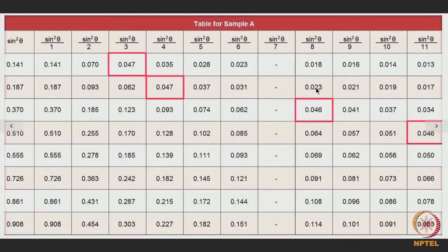And when we divide the sin square theta value of line number 3 by 8, it gives us a similar value, 0.046.